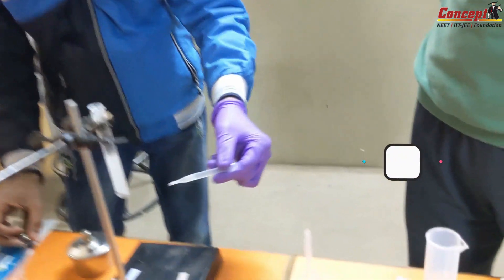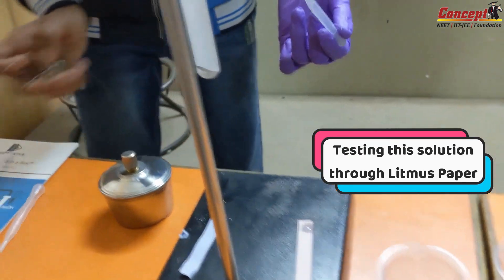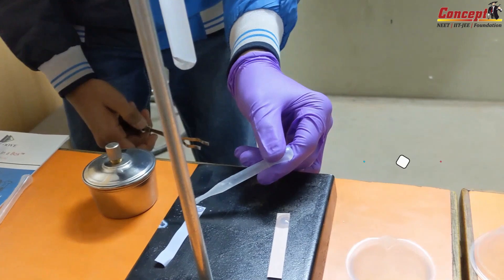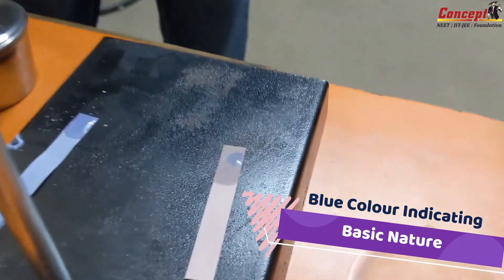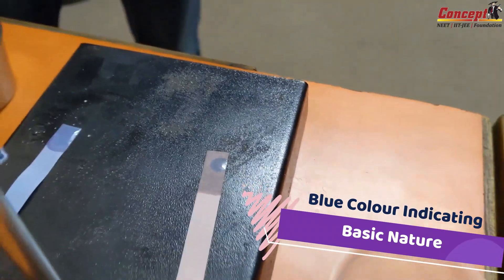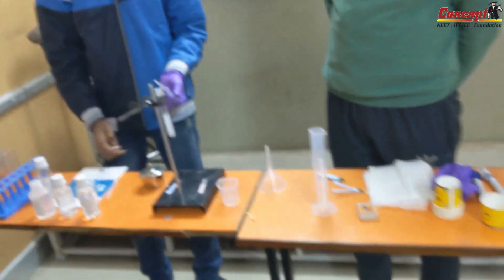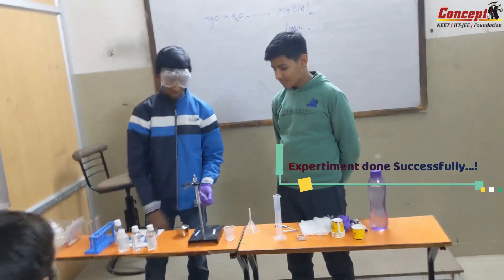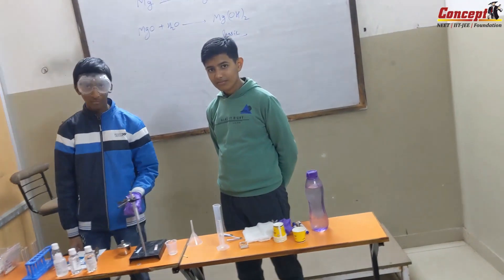Yes, now put one drop on there. Can you see the blue color here? Yes sir. What does it indicate? It's basic, right? Successful experiment by these two young guys — clap for them!